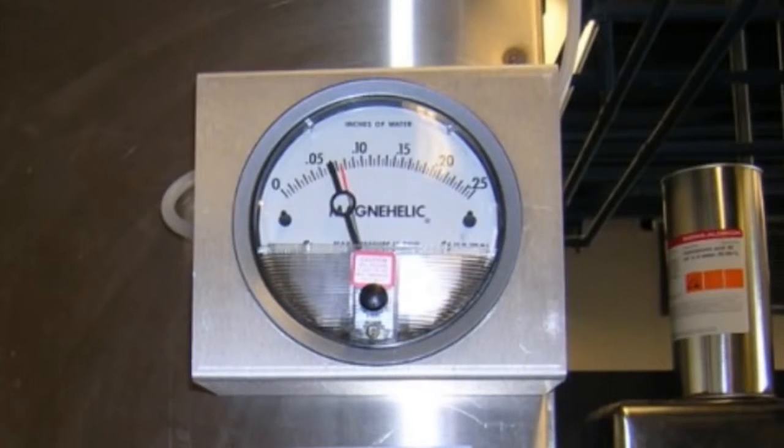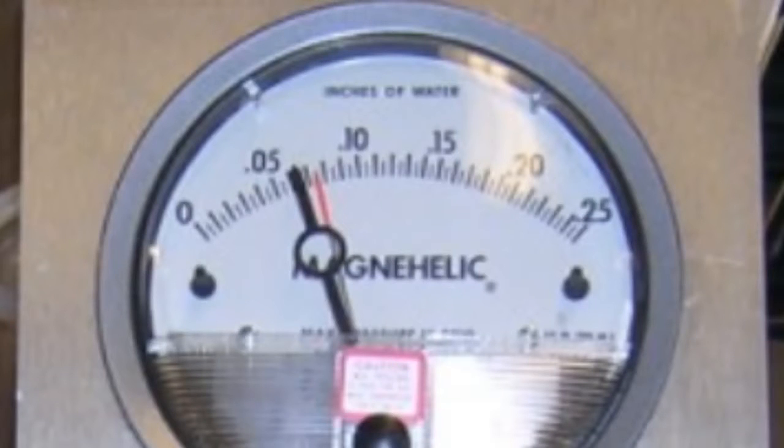Differential pressure gauges measure the difference in air pressure between the room and the hood's exhaust duct in inches of water. The red indicator should be inside or above the circular target.